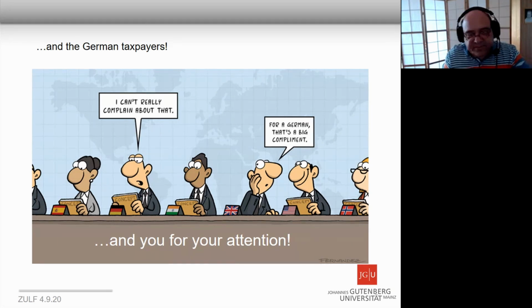Thank you. That was an exciting talk. We had some questions. So Malcolm asked, what is the limitation on making Halbach arrays very small? Not so sure. This morning I had an idea that in principle you could just run a wire through a magnetized ring of magnetizable material and put a big discharge over that to essentially imprint this kind of pattern into that. I'm not sure, I want to try this, but I need a big capacitor for that. I first have to look for that.